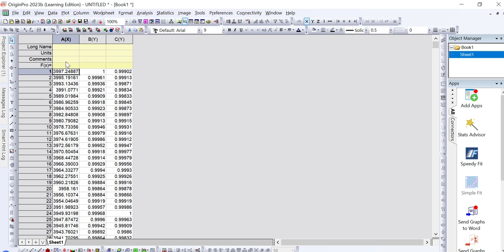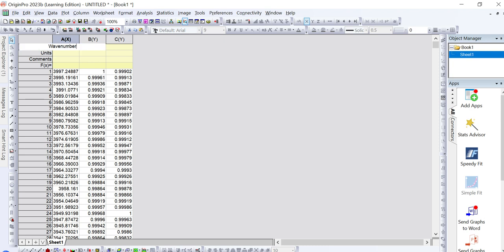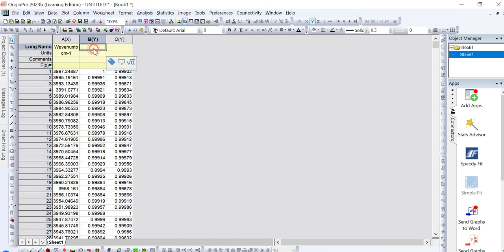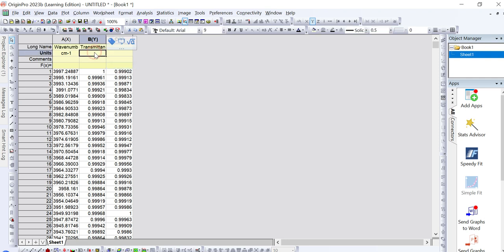After adding your data, you need to mention the axis titles. On the x-axis, write 'Wave Number' with the unit per centimeter. On the y-axis, write 'Transmittance' with the unit as percentage.